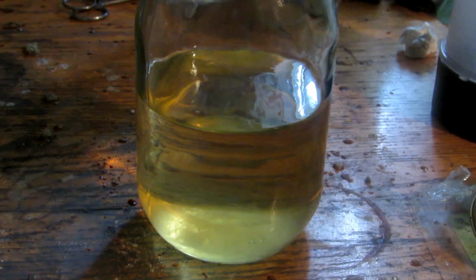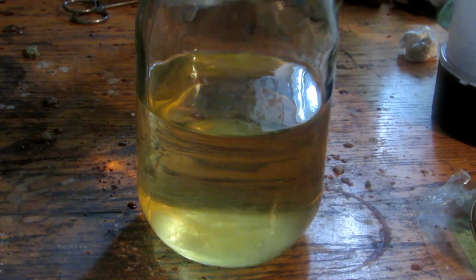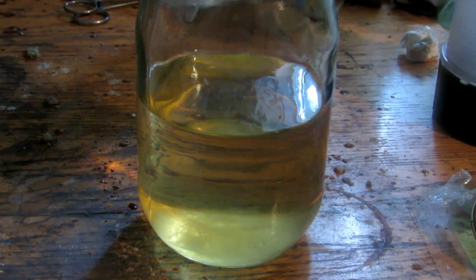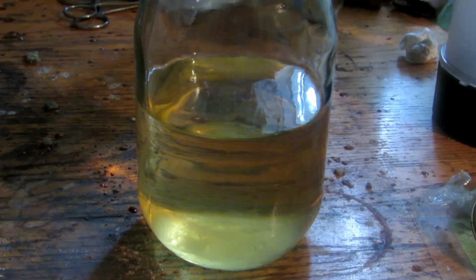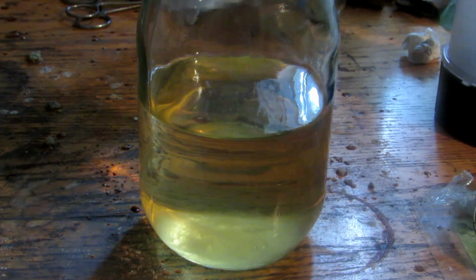Okay, so now that we've filtered everything off, you can see that we're left with this totally clear solution, although it is discolored. But that's totally fine. It's probably just impurities which were dissolved into the water, but we'll be getting rid of these as we turn it back into silicon dioxide. So the next step is actually to turn this to silicic acid.